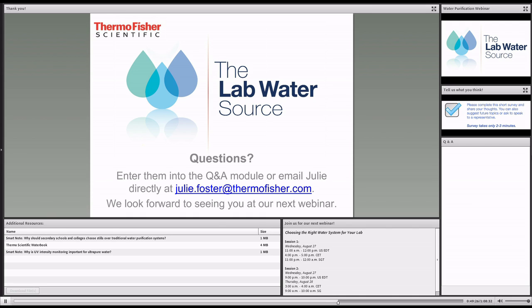Our first question: what is the max amount of time RO water can be stored in a storage tank? This particular user says the tank has no UV lamp and the water system is being switched off at night by a customer. Anytime we think about storing water, the same rule applies no matter what type of water, if it's type 2 or RO water. You always want to turn over the water in the tank every day to every 2 days at the very most. That's the best way to keep the water bacteria free.